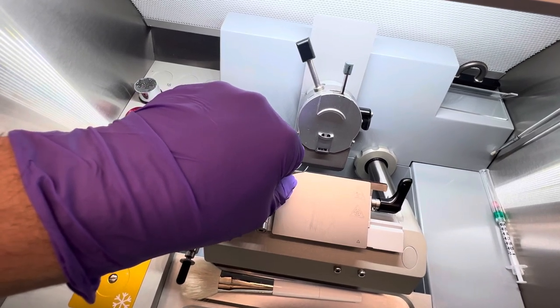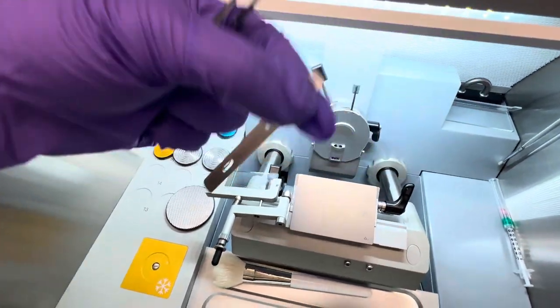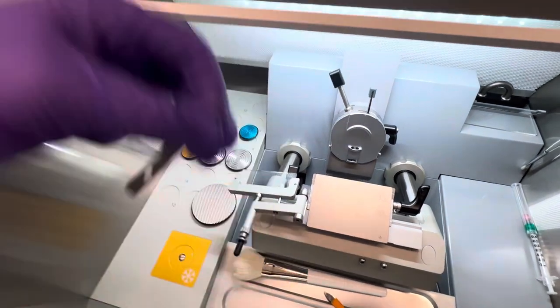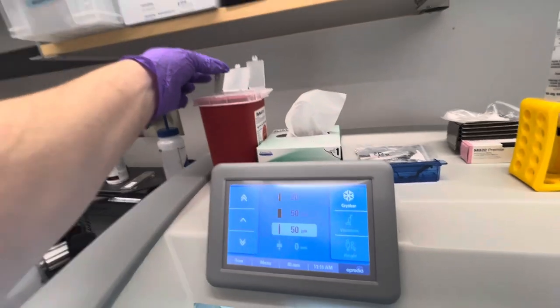Now, the way that I usually do this, if you don't want to cut your hand, is you can just go from the side and push it out like that. Carefully grab it from the sides, not from the blade. Again, you'd be surprised. If you're being gentle, it doesn't seem like it'll cut you, but if you're not careful, this will just easily slice it open. And again, put it in the sharps bin.